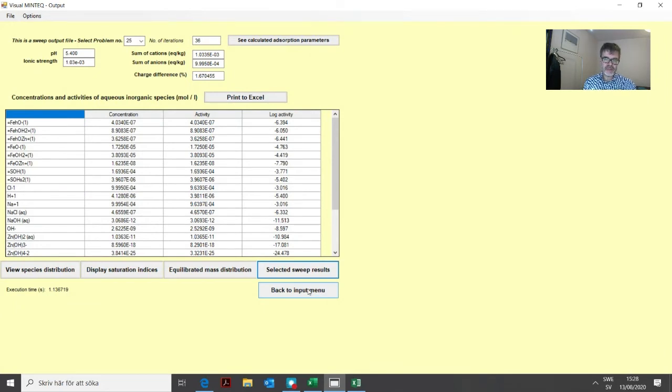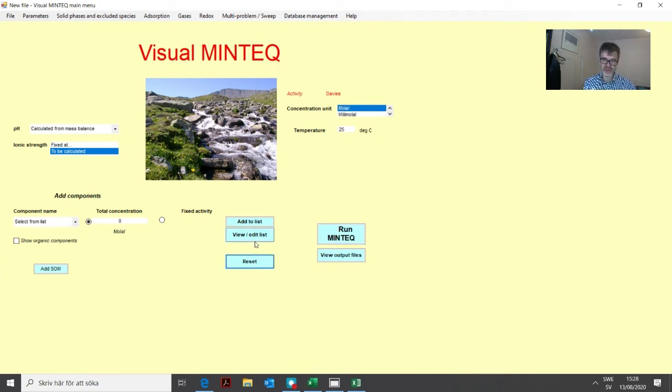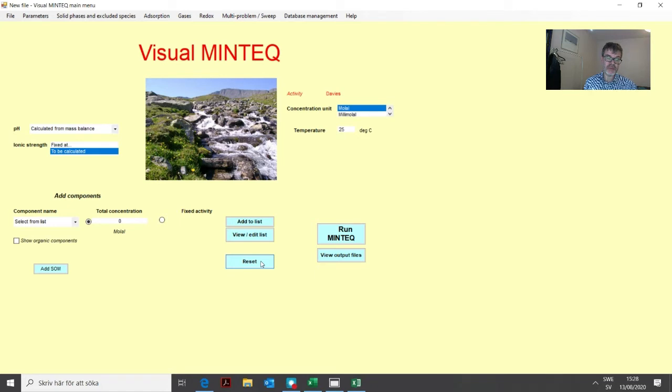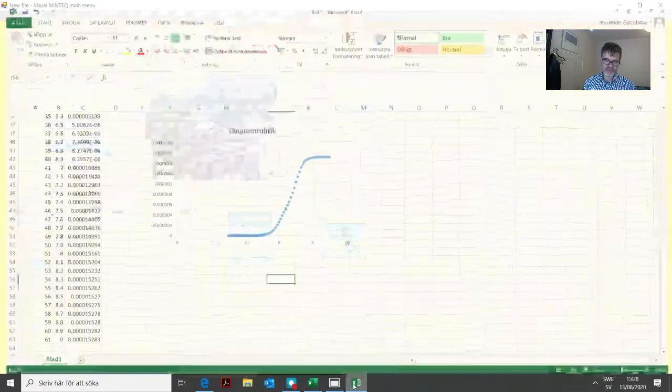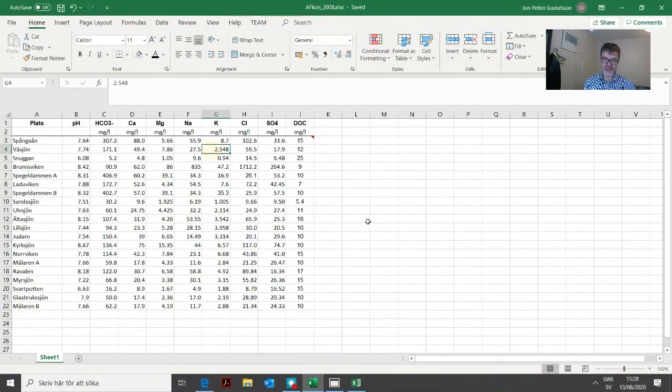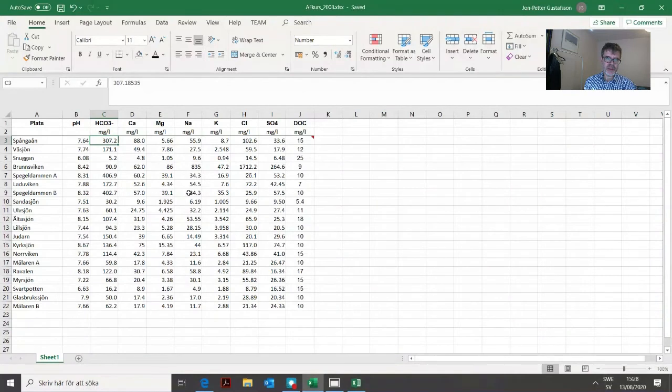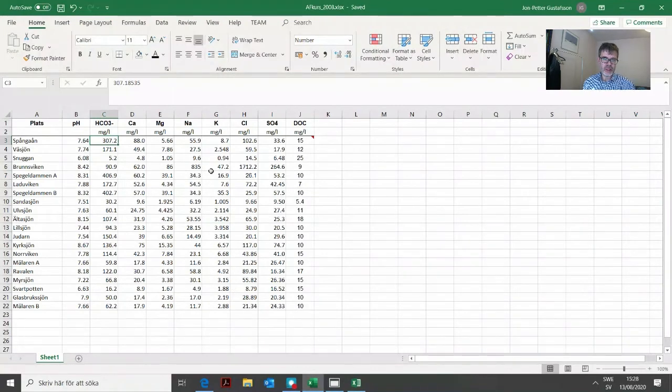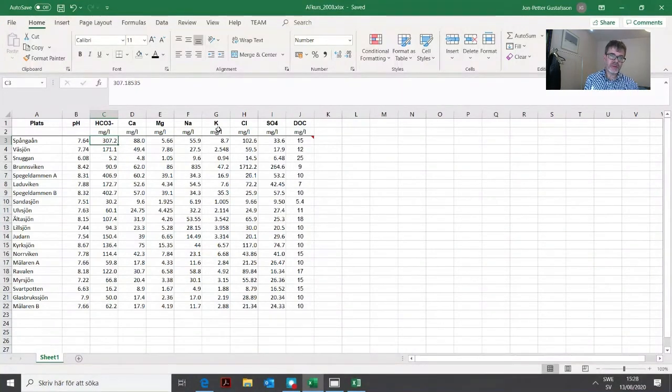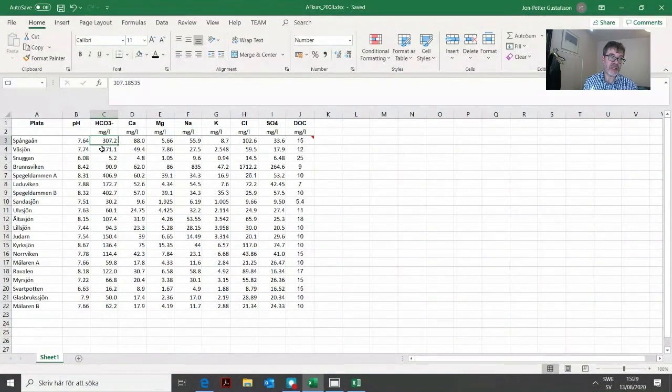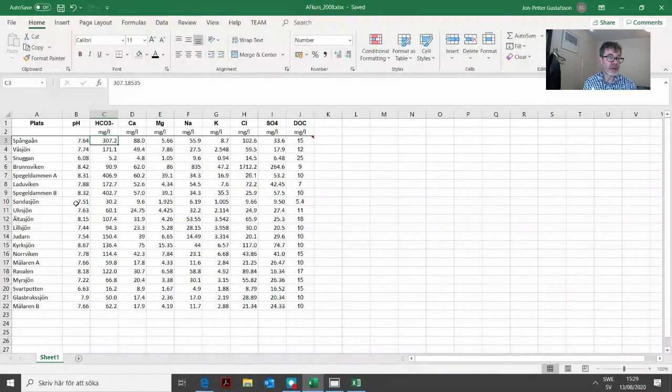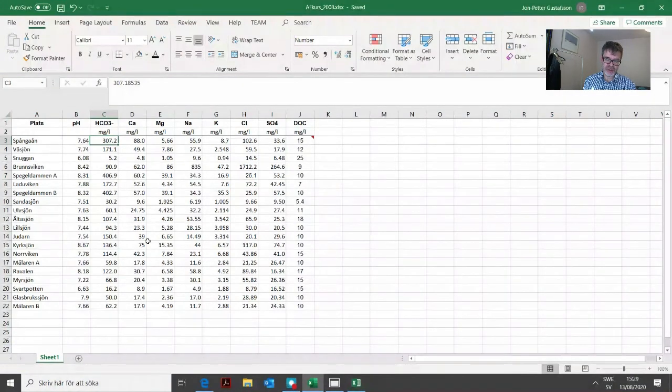Now we can go back and start over with a completely new problem. We will demonstrate how to use the other important option, the multi-problem generator. We will look at another Excel file. Here we have water chemical data from some lakes, mainly in the Stockholm area. We can import all these to Visual MinTeq and calculate the saturation index with respect to calcite in all these lakes. We have 20 different lakes.